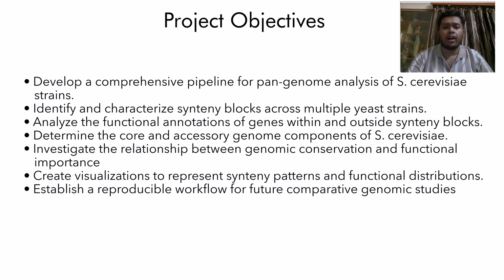Fourth, we are determining the core and accessory genome components of Saccharomyces cerevisiae to understand the genetic basis of strain diversity. This involves identifying which genes are present in all strains versus those that are strain specific or present in only a subset of strains. We are also interested in the functional characteristics of these different components.